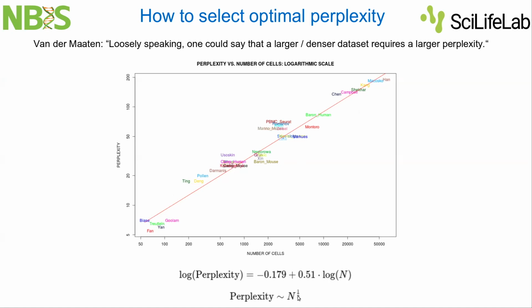So basically, it's just a rule of thumb. It has some more mathematical justification, so it's not just an empirical fact; in graph theory, this rule is actually quite well known. For KNN graphs, the way they select the optimal K is through the square root of n. So if you are not sure what perplexity is appropriate for your particular single cell data set, just take the square root of n, your number of cells, and you will not be completely off. This is my recommendation.